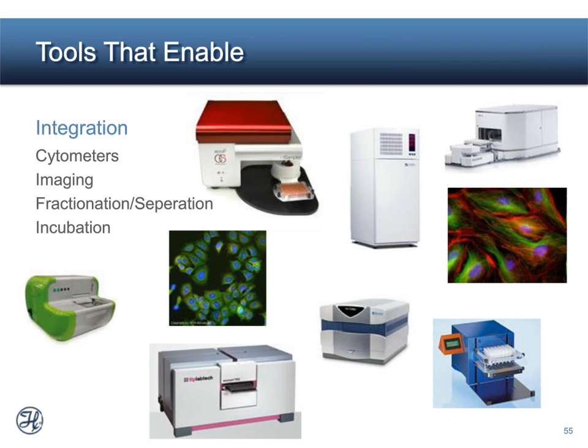The other thing is the ability to integrate. As everybody knows, cell culture is a very multidisciplinary field, and along with just maintenance of cells, they need to be quantitated, or some kind of image acquisition has to occur during the process. So looking at how the vendor integrates the devices and what kind of software they offer to do the image quantitation and control of the other devices.